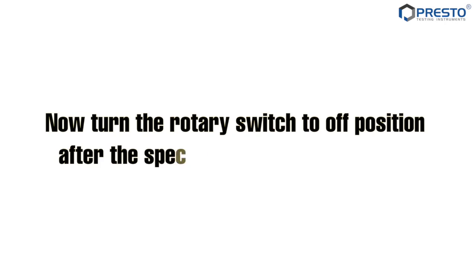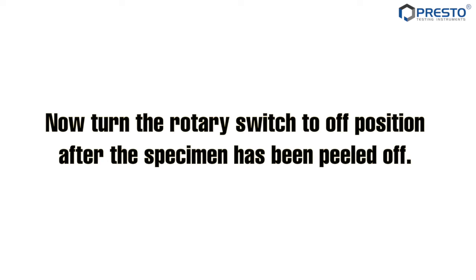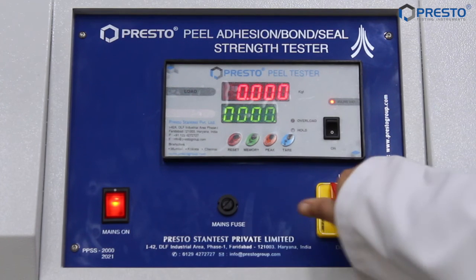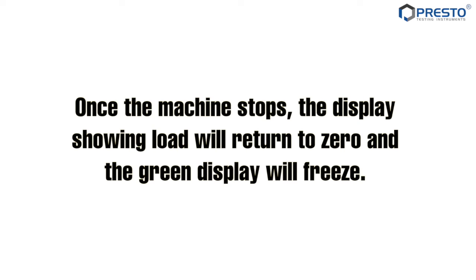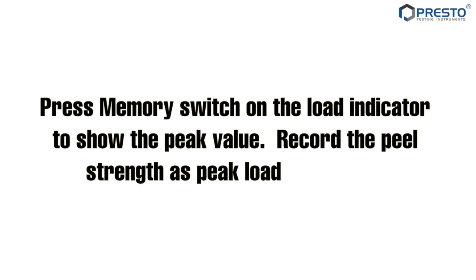Now turn the rotary switch to the off position after the specimen has been peeled off. Once the machine stops, the display showing load will return to zero and the green display will freeze. Press the memory switch on the load indicator to show the peak value. Record the peel strength as peak load for 25 millimetres.